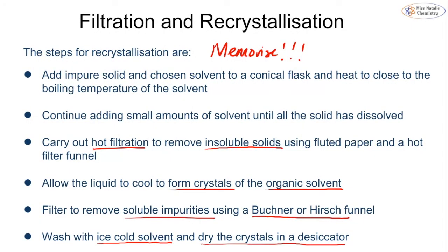So it's very important that we understand that it is the minimum amount of solvent. We don't want to use more than what we have to. And then we allow it to cool in order to form our crystals.